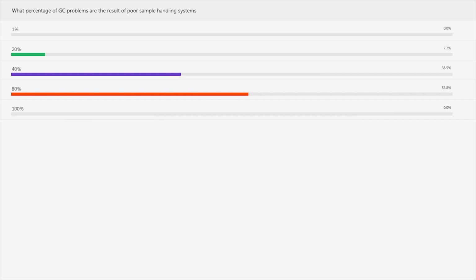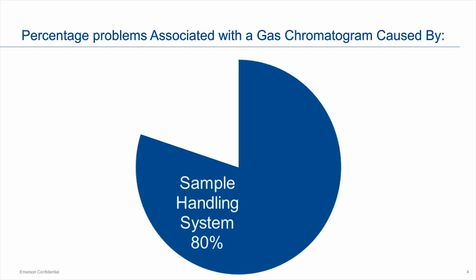All right, so we've got a smart audience here for not attending any past webinars. You are correct. 80% is the number that you will generally hear people talk about. So you can understand why it's important to us, because when something goes wrong, of course, it makes our GCs the prime suspect. And a lot of times it's actually not the GC itself. It is the sample handling system. And it's just because it's very complex and there are many integral parts. So if you get one part wrong, the rest of the system can't make up for it.